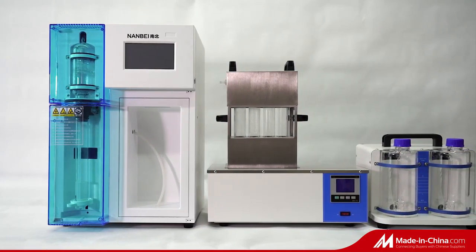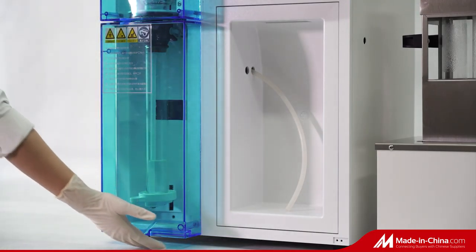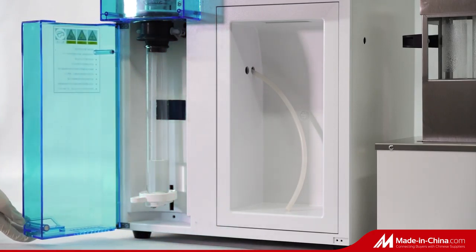NB9830 Automatic Kjeldahl Protein Analyzer. The whole set includes a distillation unit, digestion furnace, waste gas collector, and acid-base neutralization unit.